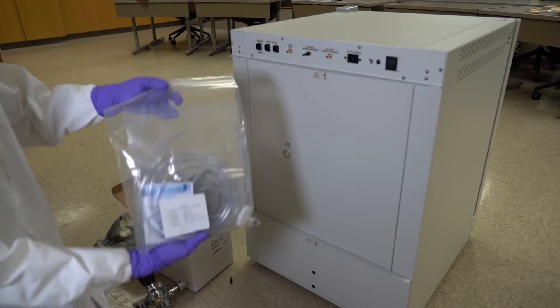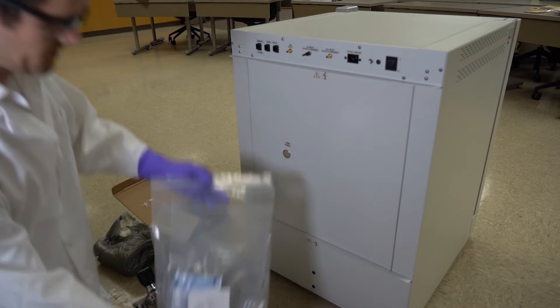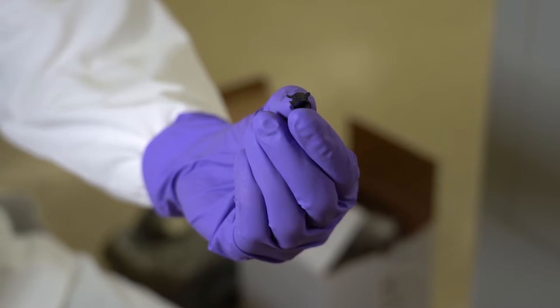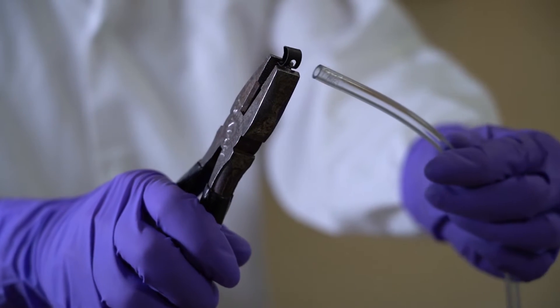Open the plastic bag of parts and find a long vinyl tube measuring six feet or two meters long. Connect one end of the tube to the CO2 inlet on the back of the incubator using a black clamp.